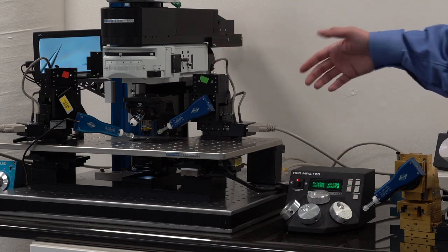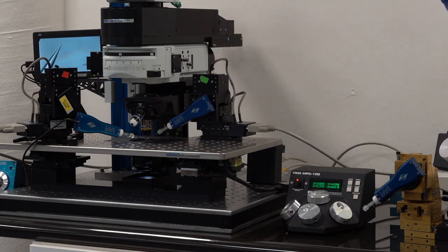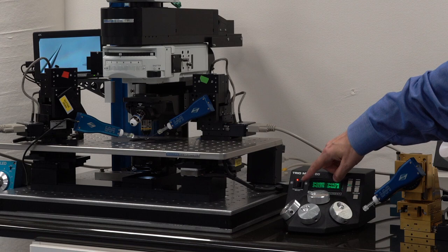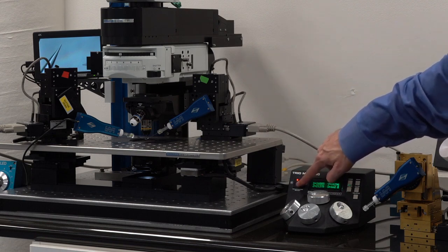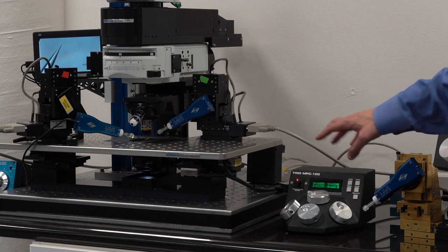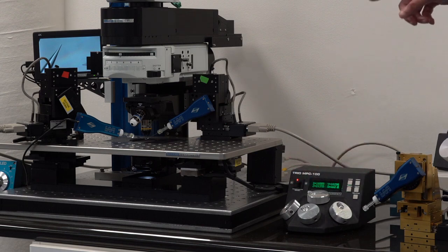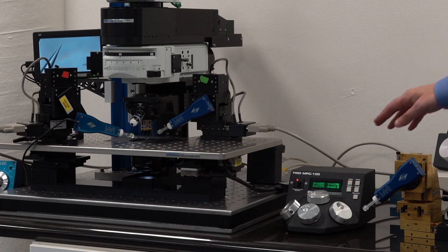So I can then switch between manipulator one and two. With this one, you cannot daisy chain and have four devices, just two. But it's a very, very simple box.